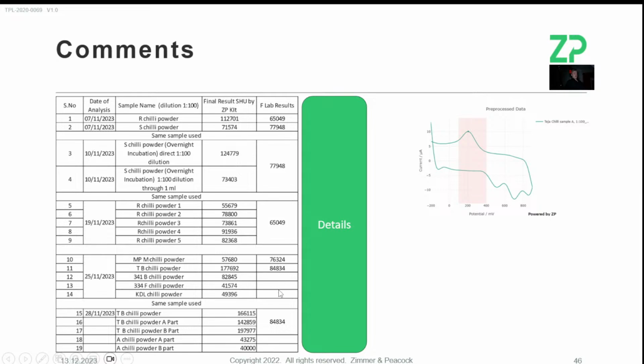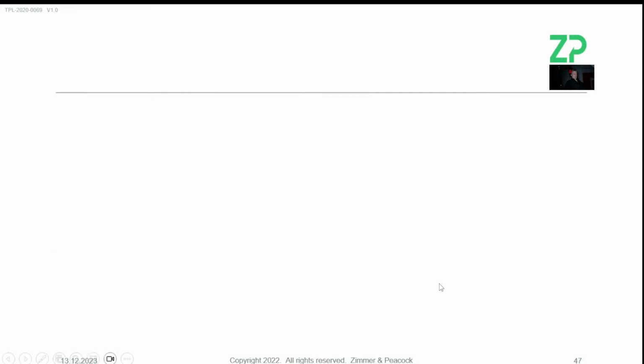but I can then go back and verify your FoodSense Gen 4 results, because I can look at the raw data, but I can't do the same on HPLC, because those chromatograms and that calibration data is not available to you either. If you give us the details about what you're actually doing, then I call that metadata. Then we can look at the data versus the real details that you give us, and then we can really kind of help.